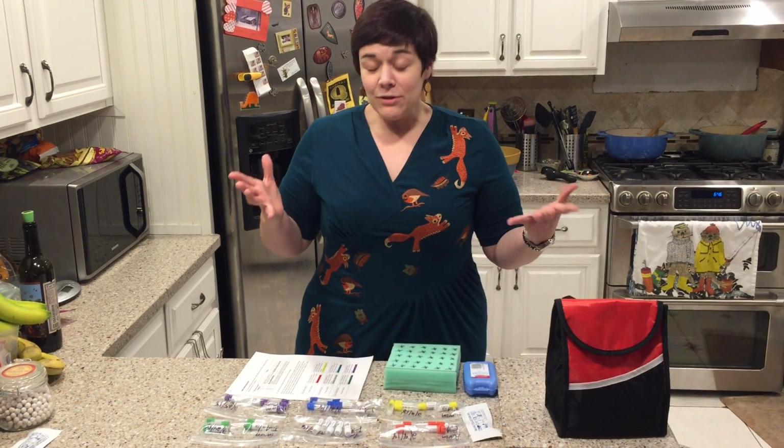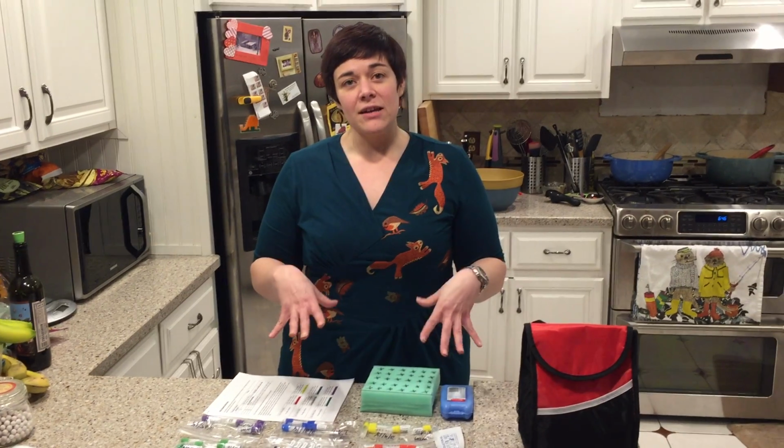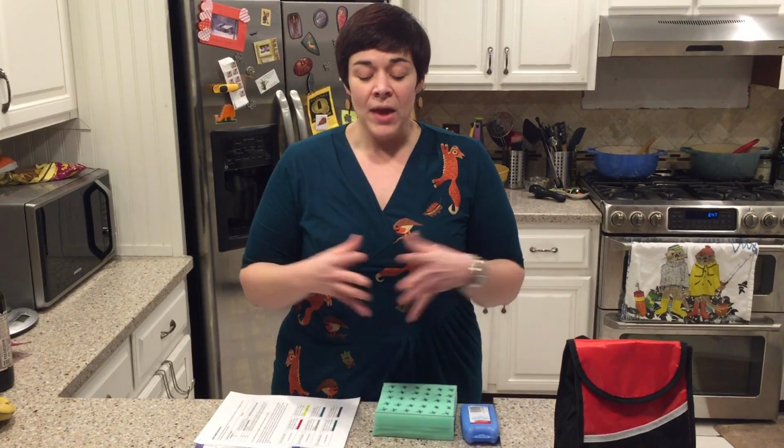This little video is to tell you all the stuff that you're going to get for the saliva data collection that you're about to start. And then I'm also going to give you some instructions and a few tips on how to collect your saliva when you are actually ready to do so.